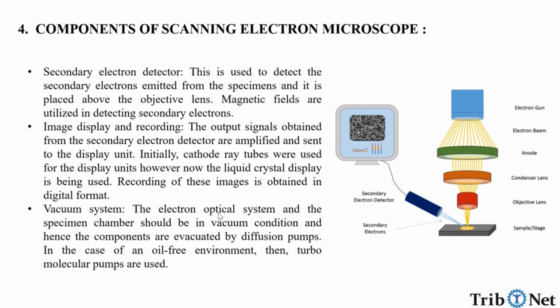Vacuum system. The electron optical system and the specimen chamber should be in a vacuum condition, and hence the components are evacuated by diffusion pumps. In the case of an oil-free environment, then turbomolecular pumps are also used.